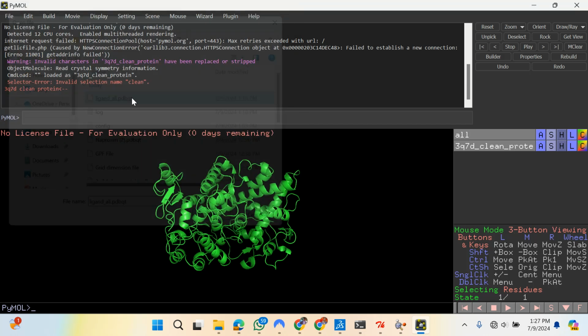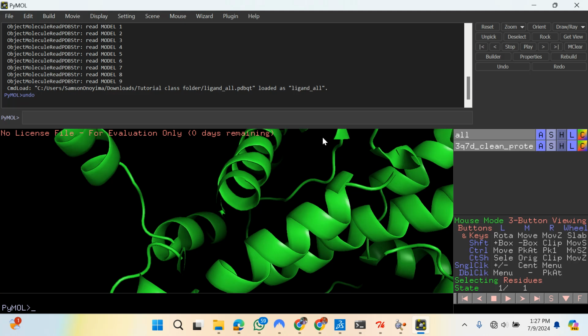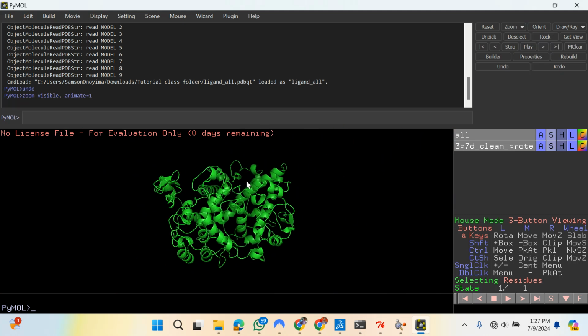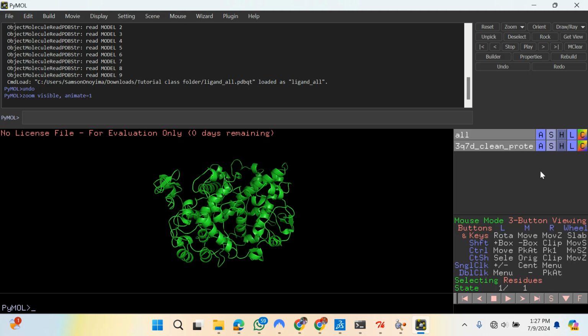So I'll click on that. I just pressed Control Z and took it off, but you understood how to do this. This is what I have. You got to here, right? I just click on open, go to clean protein, and click on it to open it. Let's do that again.